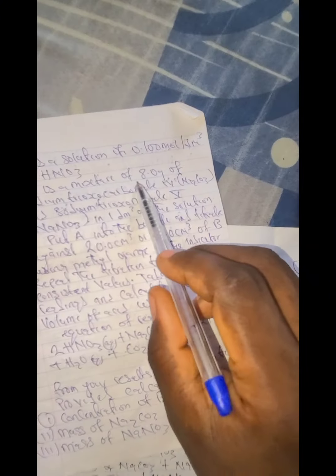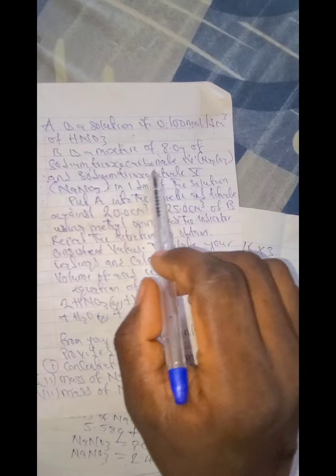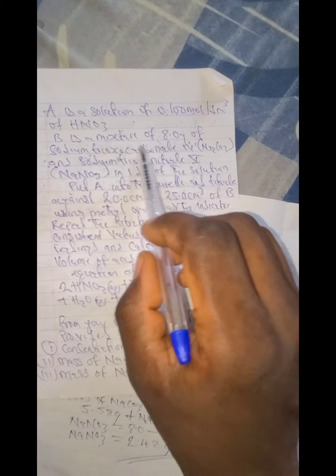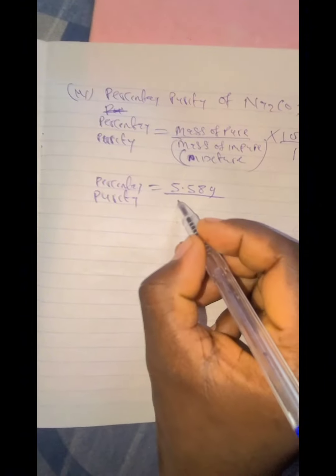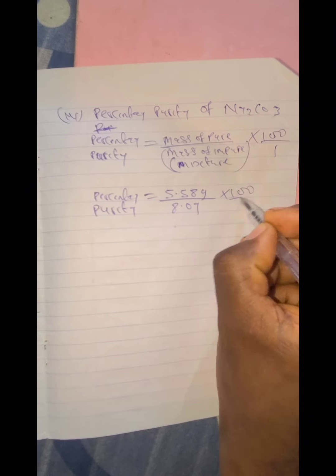What is our mass of impure in the equation? The mass of impure in the equation is 8.0. I told you that the mass of impure is the mass of the mixture. That is the impure, the mixture. So 8.0 gram times 100 over 1.